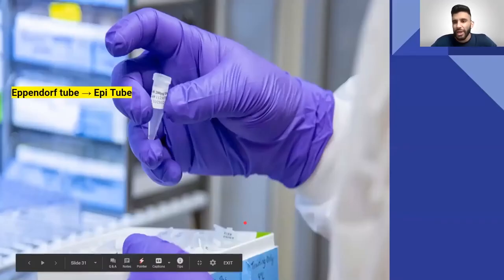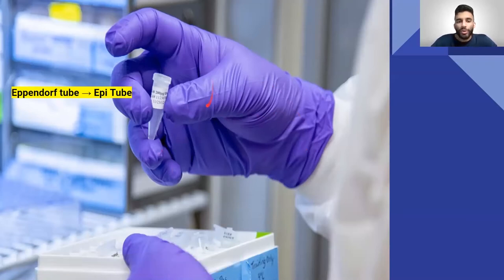With wet lab research, before we go into anything specific, I want to review a few things. Wet lab basically means you're working with actual chemicals and reagents — harmful chemicals, DNA, and things that are very fragile. So you always want to wear gloves. Some labs may require a lab coat, but most of the time you can wear normal clothes. You have to wear closed-toe shoes, and if you have long hair, you need to tie it up so it doesn't fall into your DNA and ruin your experiment.